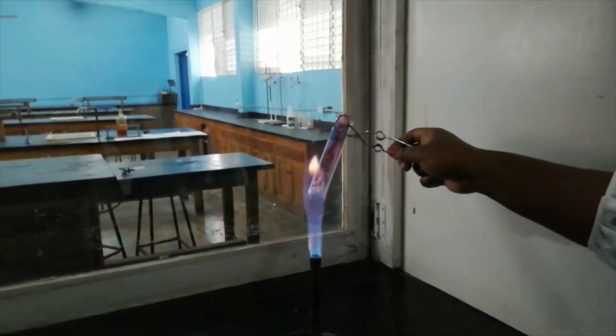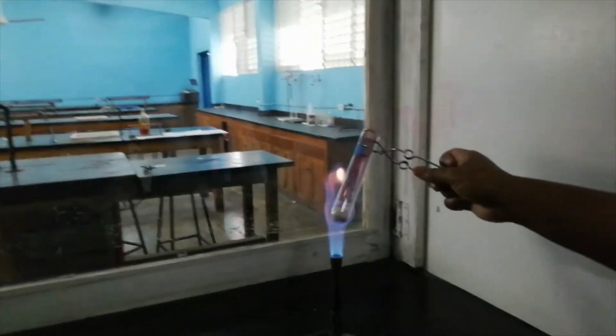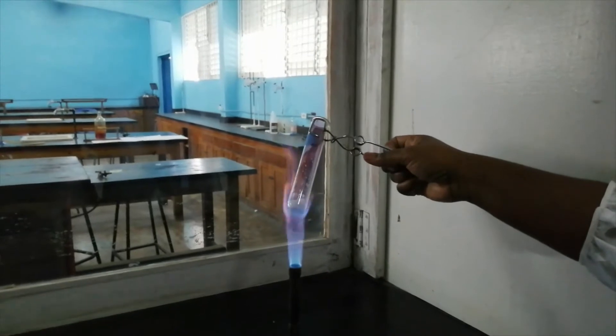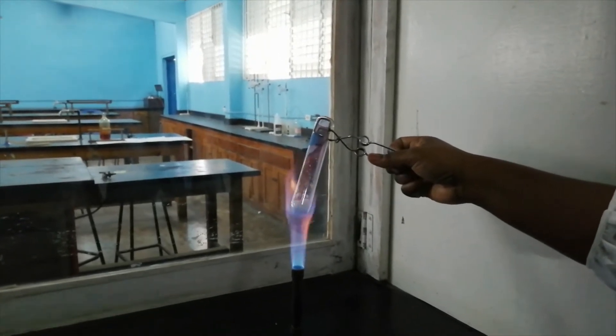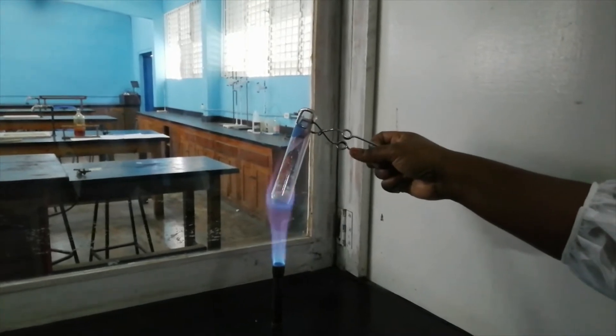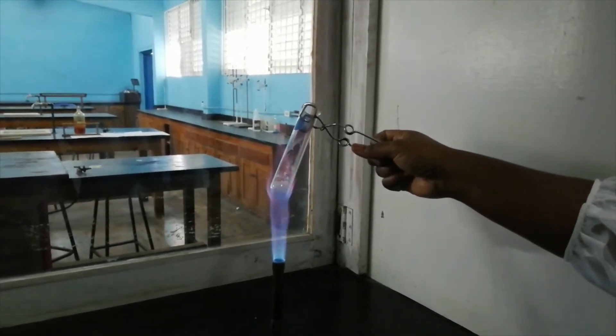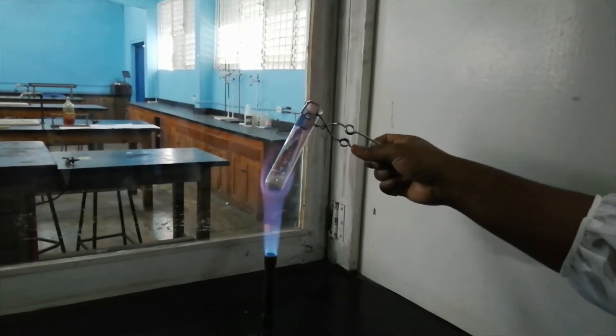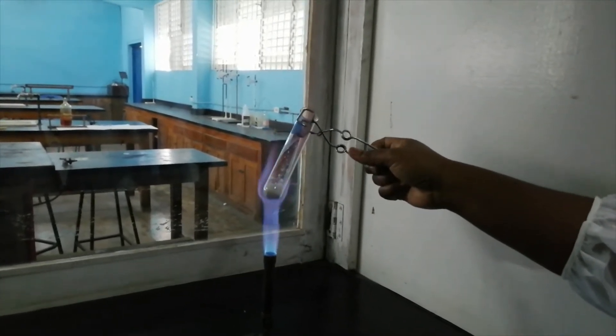So remember this separation is based on differences in melting point and also boiling point. So from this, you can infer that the sodium chloride has a higher melting point and boiling point than the iodine, which is why the iodine now is basically vaporized.